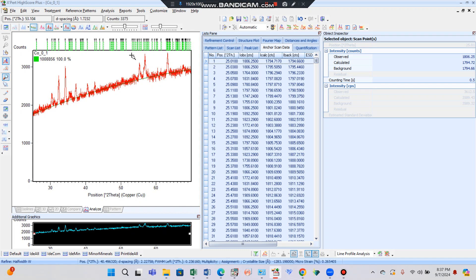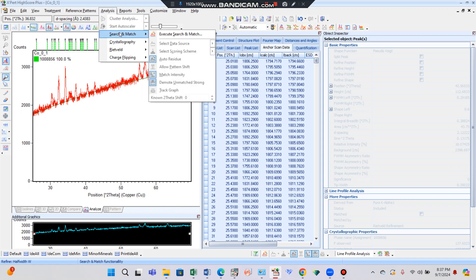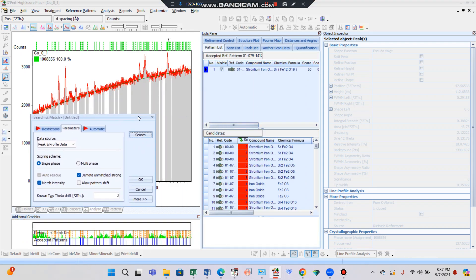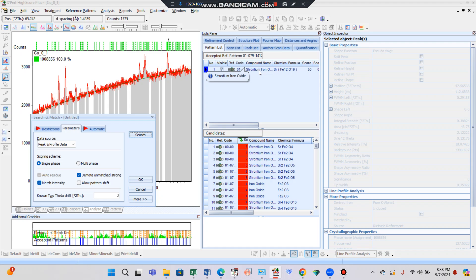The next step is Search and Match. Click Analysis, then Search and Match, and execute it. Search and Match can be executed in two ways — one is to set the parameters and click Search. We will get the standard JCPD card matched with our diffractogram. By clicking Search, here we get the strontium hexaferrite peak graph — the JCPD card obtained by searching.